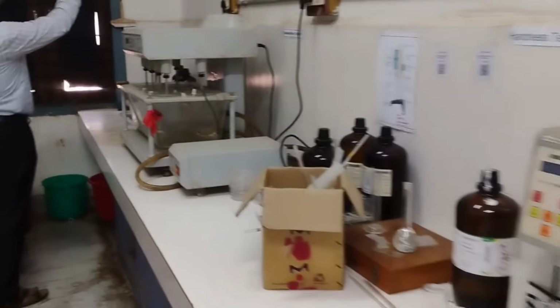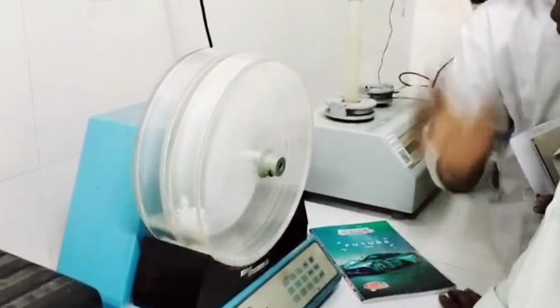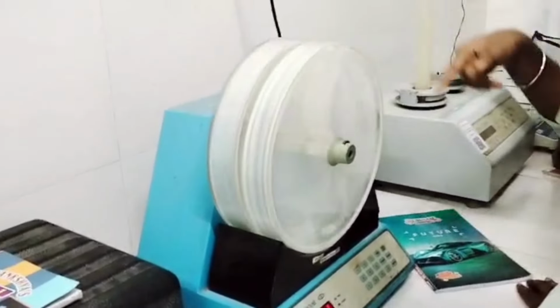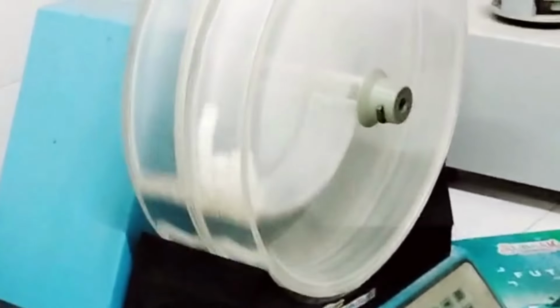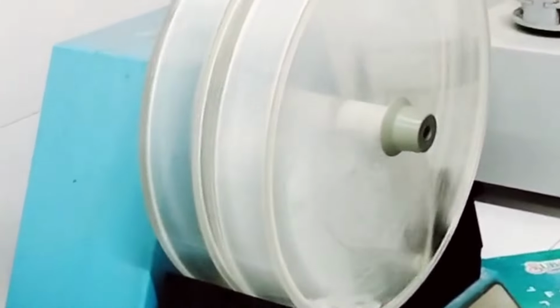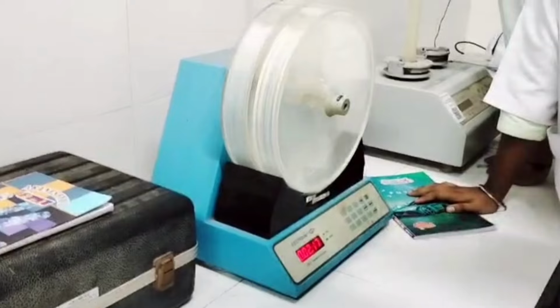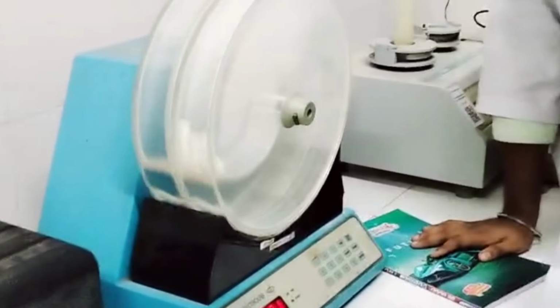Today we will evaluate the given tablet sample. Tablets are defined as solid unit dosage forms of medicaments intended for oral use. They became most popular as they are easy to prepare compared to any other type of dosage form, but the major drawback exists in their manufacturing. If any minor problem occurs during their manufacturing, then the whole batch of the unit is discarded.